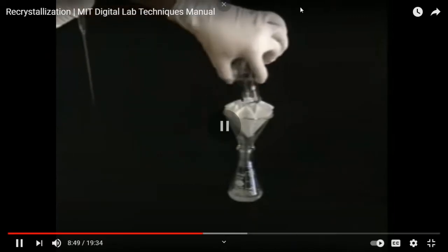Okay, she's washing the flask or sometimes the paper with an extra hot solution because you see crystals actually crystallizing. That's not good, okay? And you know why. If you have more liquid, the solubility increases when you cool down. Here, when you cool down with more liquid, you're not getting as much yield because more liquid means more solubility, so you lose some main compound.